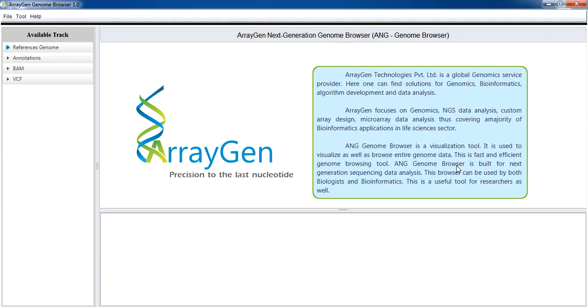Built for data analyzed using next-generation sequencing methods, this tool can be used by biologists, bioinformaticians, and other researchers.